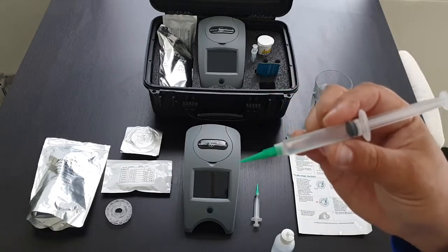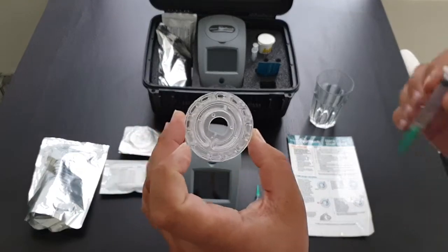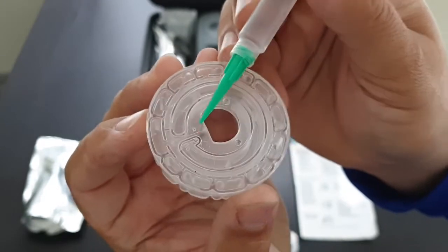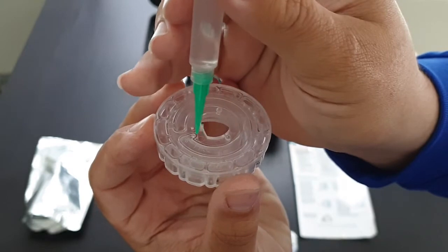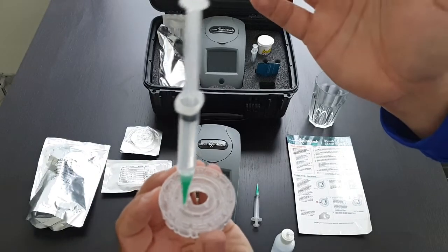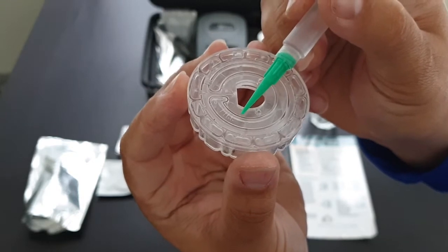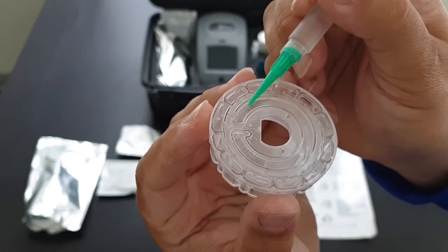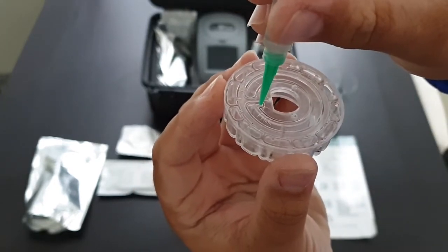Once you have your syringe filled with water, get your spin disc — there is a fill point just here. The syringe sits in the fill point; you don't have to push it in, it'll just sit there. Fill each chamber up to the fill line. Make sure there's no air in the disc.